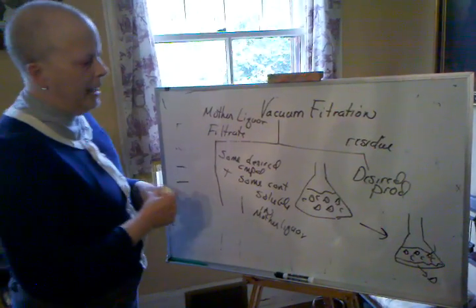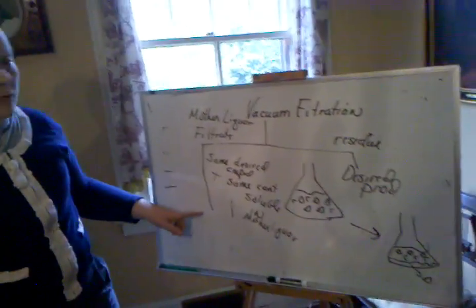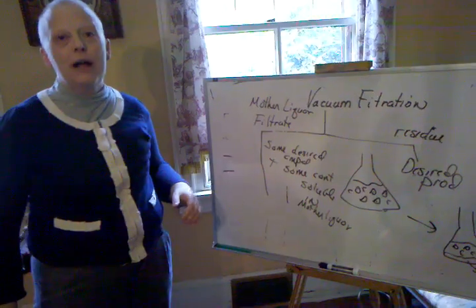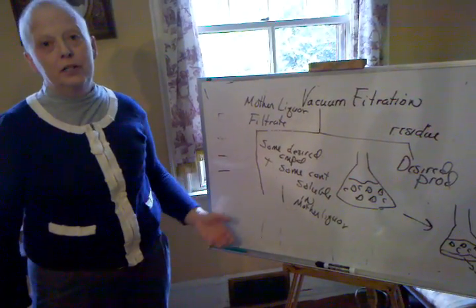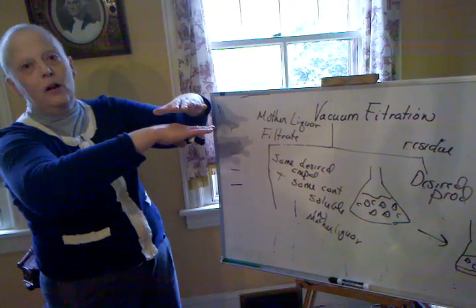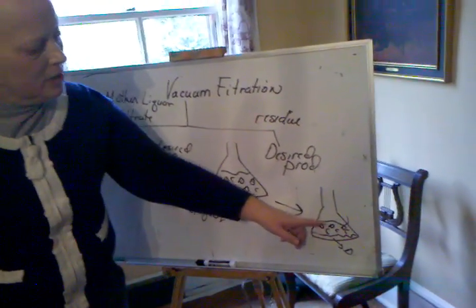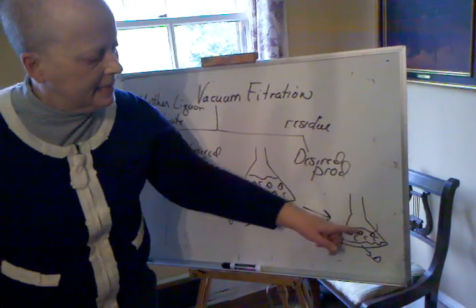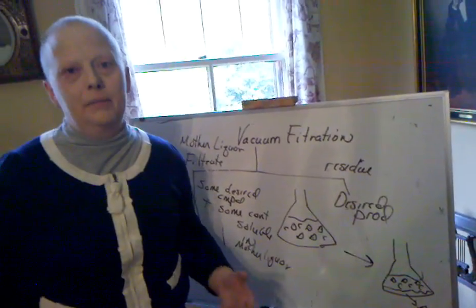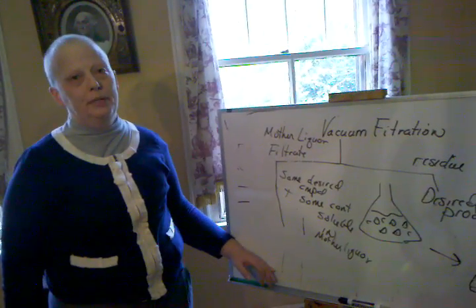So you'll get this material out. Realize you could, in principle, isolate more of the D compound from the filtrate if you concentrated the solution. So there's such a thing as a second crop and a third crop and a fourth crop of material that could come out if you kind of start losing the solvent, if the solvent's evaporating off. But those crops will be increasingly crude, because if you get the solution concentrated enough to get the D that's still in solution out, you're more likely to also exceed the solubility of the contaminant molecules. I don't know if that makes any sense, but I want you to think about that a little bit. So there's such a thing as other crops here, okay?